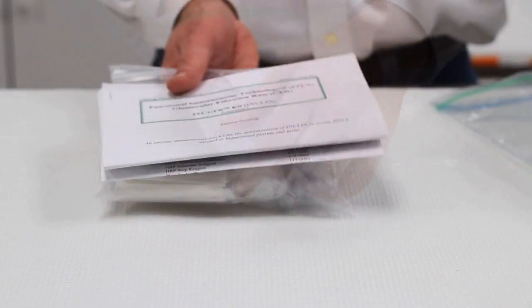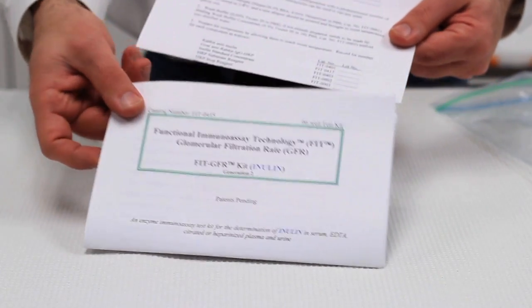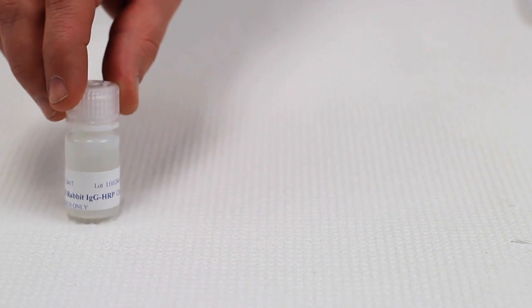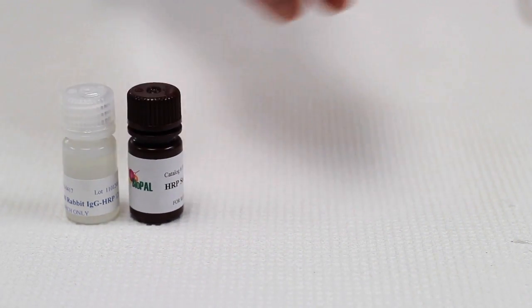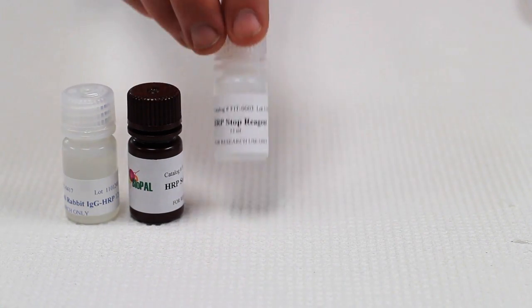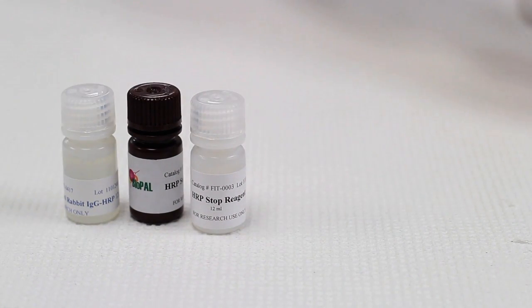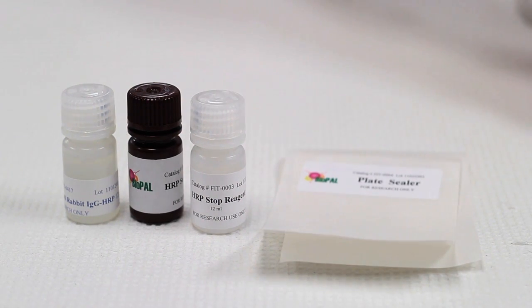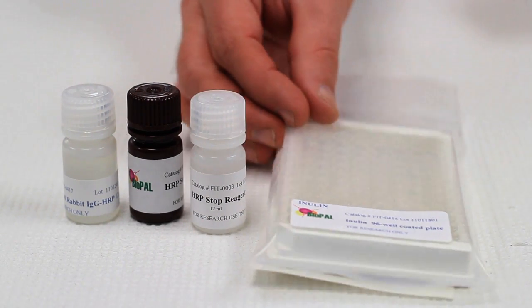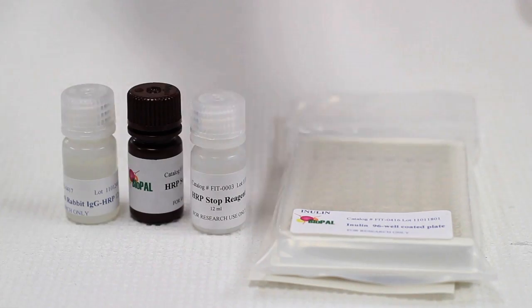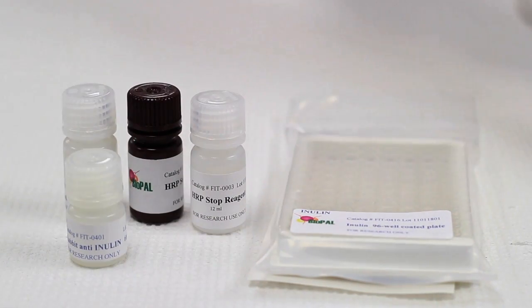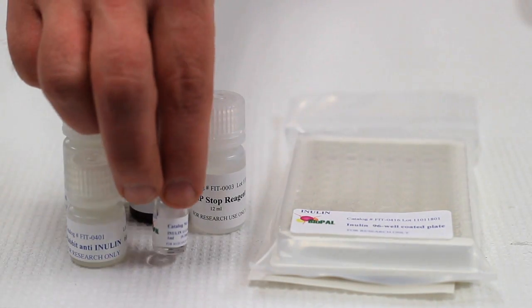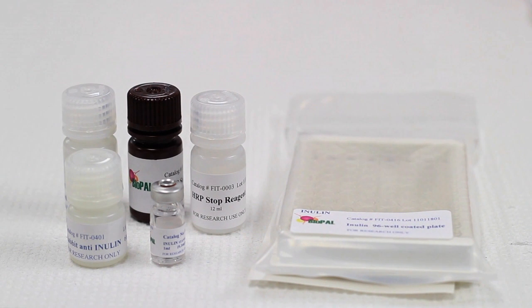Each kit contains eight components: one kit manual, one bottle of goat anti-rabbit IgG-HRP, one bottle of HRP substrate reagent, one bottle of HRP stop reagent, two plate sealers, one 96-well probe coated plate, one bottle of rabbit anti-probe, and one bottle of probe standard concentrate, which will be either inulin or iohexol.